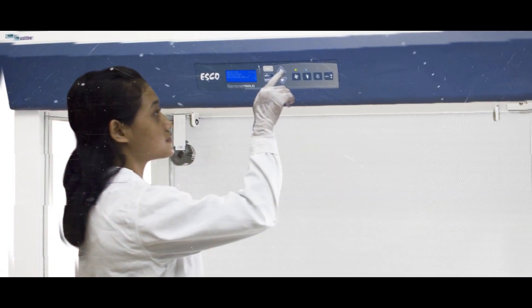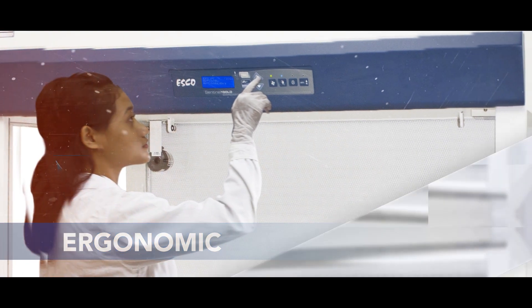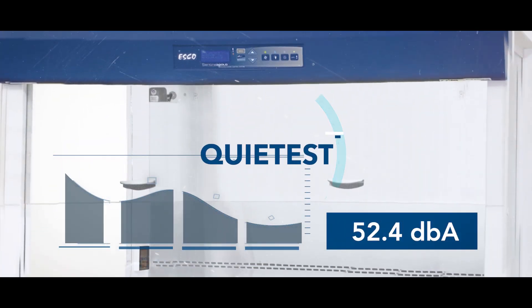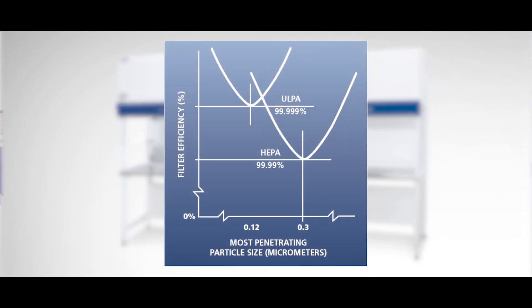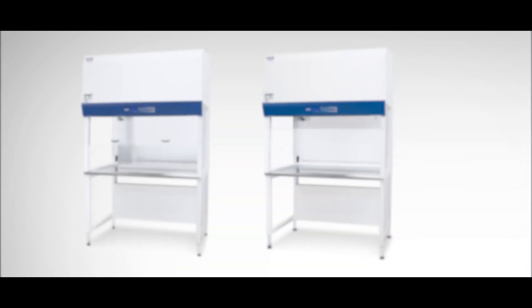Esco Airstream is designed to be the most ergonomic and quietest laminar flow cabinet in the market. The cabinet provides an ISO Class 3 work zone and is equipped with a ULPA or H14 filter that is 10 times better than the usual HEPA filter in most competitors.